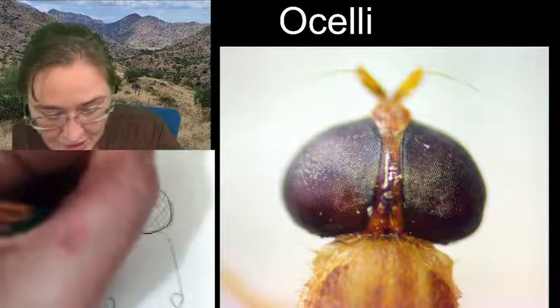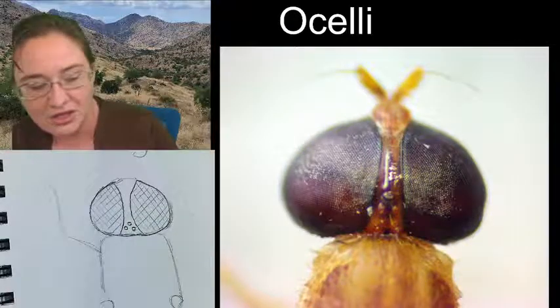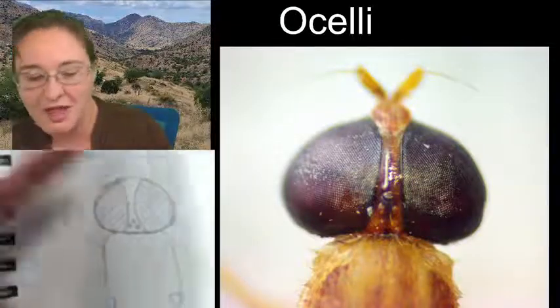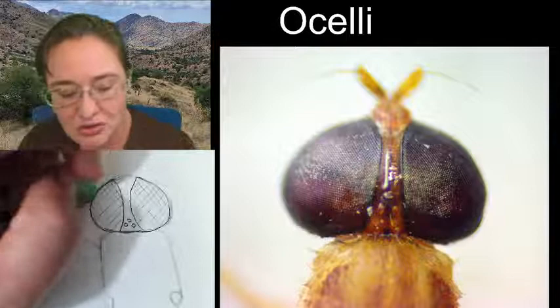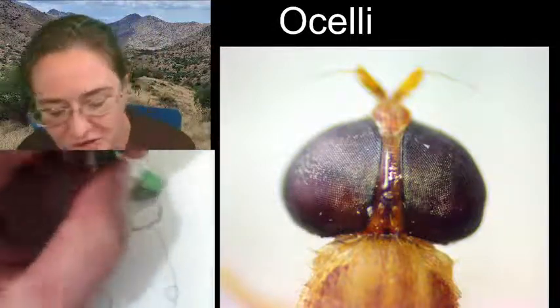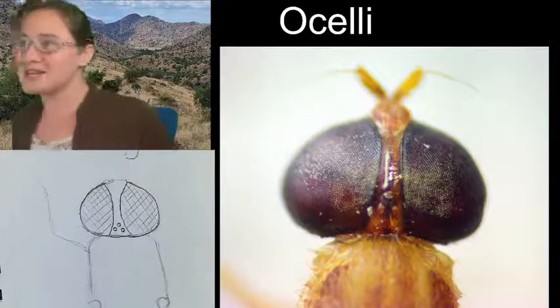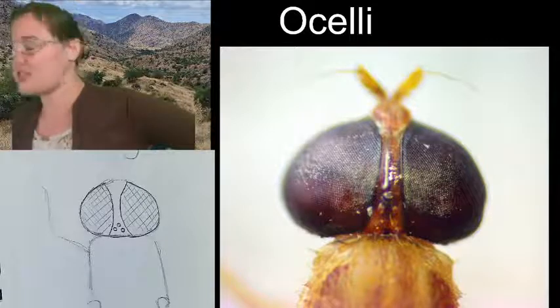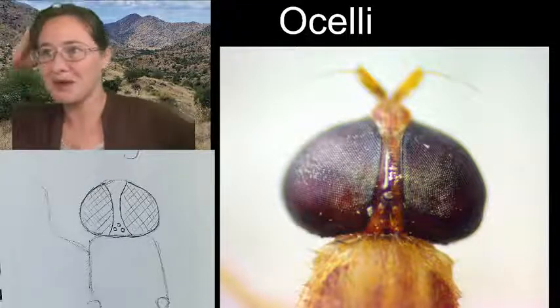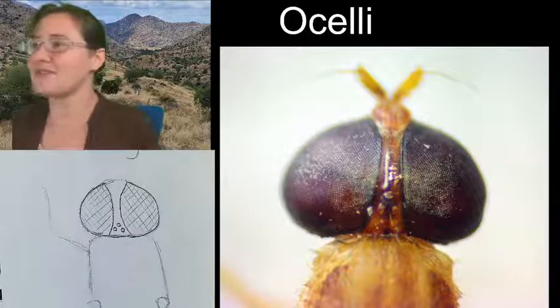I had somebody in my last Thursday class say that it was weird to see beetles' heads because they don't have any simple eyes. Sometimes we get so used to seeing one body part that it feels weird that other insects don't have them. But insects are so unique and adapted, it's amazing the different number of body parts that they have.